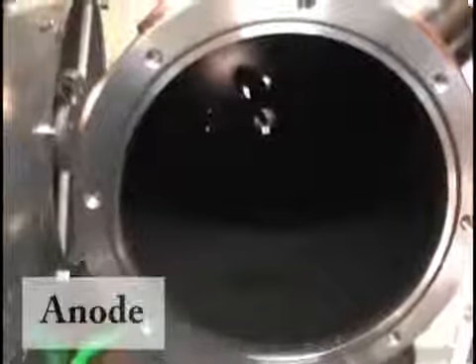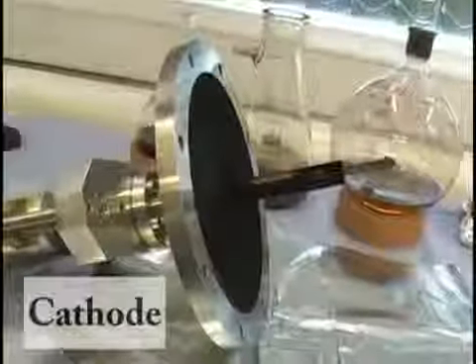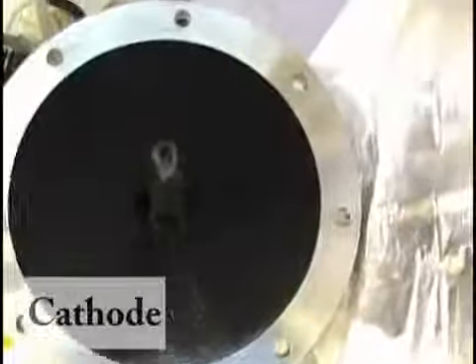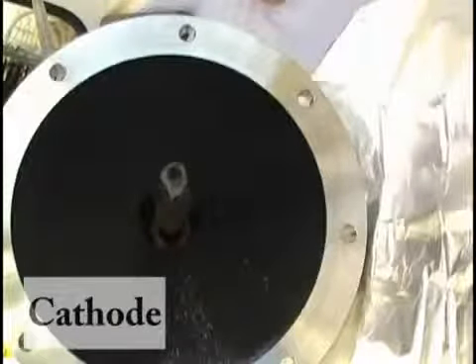Black soot is produced and starts to cover the whole chamber, including the window, so after a while we can't see anything anymore. When we open the chamber, we can see how the anode is being consumed, and the black powder is deposited everywhere around. On the cathode there is also black powder, where we will find carbon nanotubes, normally with 20 to 30 walls. Although if we also include a metal catalyst in the anode, we can obtain single-walled nanotubes.